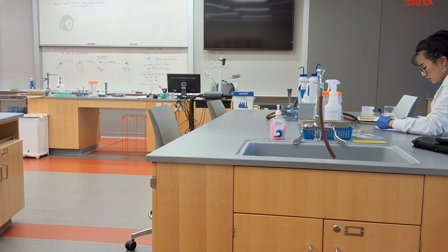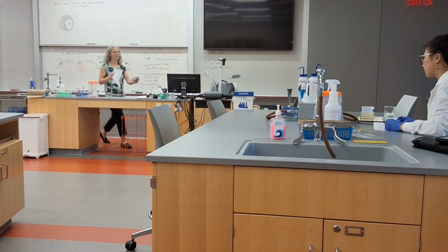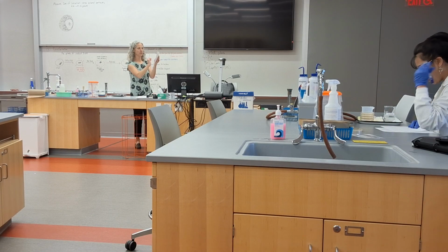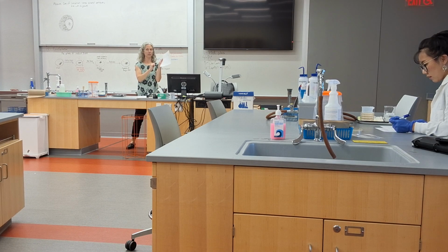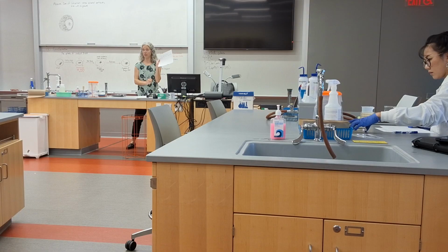Okay, so Kirby Bauer, what we're doing is we want to measure the zone of inhibition. If you remember, you prepared 4 lawn plates of 4 different species of bacteria. Note that the gram reaction of each one is listed on the top here. So we have 2 gram-negative species, E. coli and Pseudomonas aeruginosa, and then 2 gram-positive species, Enterococcus faecalis and Staphylococcus aureus. And that's important when you start to try to determine if these antibiotics are broad or narrow spectrum.